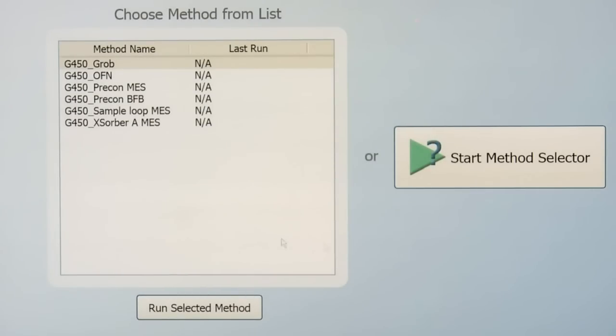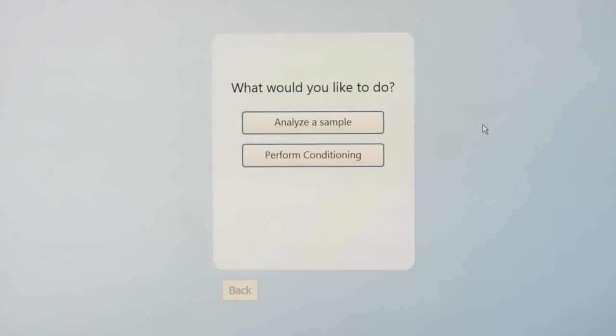Today I'm going to use the selector because I'm not sure which one to use. It's going to ask me a series of questions. First, it's asking if I'd like to analyze the sample or perform conditioning, and we do want to analyze the sample. Next, it's asking what type of sample.